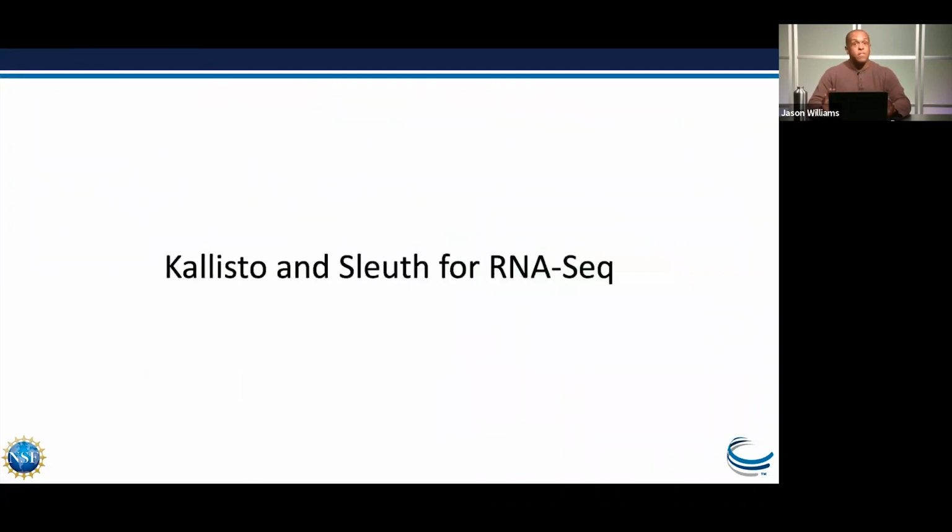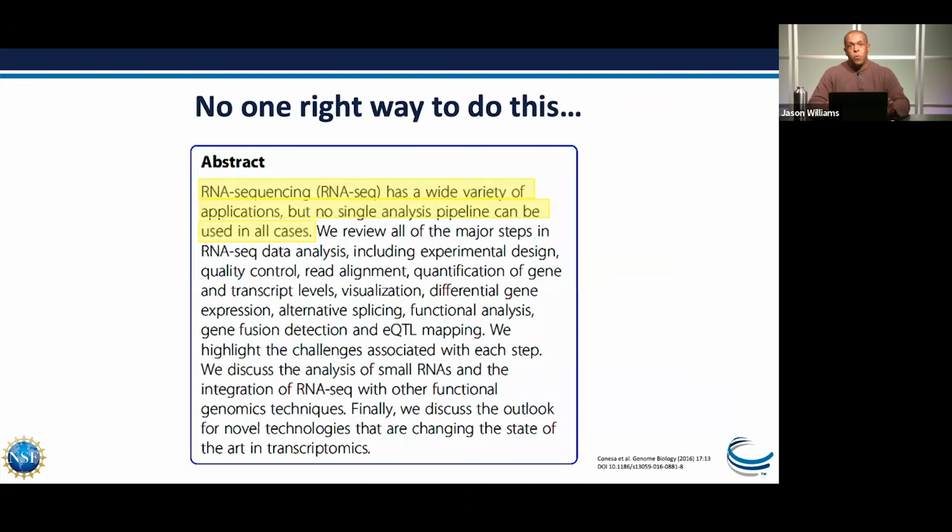So what about Kallisto and Sleuth? And again, not only will this be recorded, but I'll post the slides so anybody can take these apart and remix them in their teaching. This is a quote from a paper I really like. I believe this is from 2016. And this quote kind of encapsulates one of the things we need to think about when we're doing an RNA-Seq experiment. The very first thing in the abstract it says is that RNA-Seq has a wide variety of applications, but there's no single analysis pipeline that can be used in all cases.